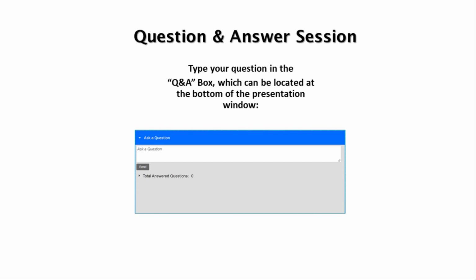Oh, sure. So there are a couple of things you want to consider when you're thinking about speeding up your methods. The first thing would be, what is your HPLC or UHPLC system pressure capability? Because if you can go to really small particle sizes and really small column IDs, then that would be really ideal for saving solvent and for the speed savings.